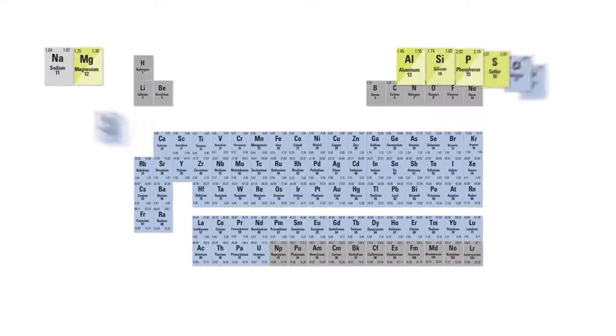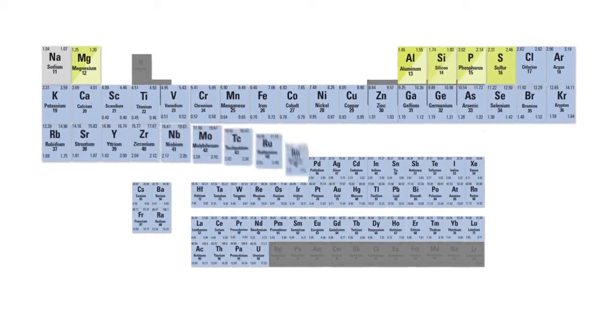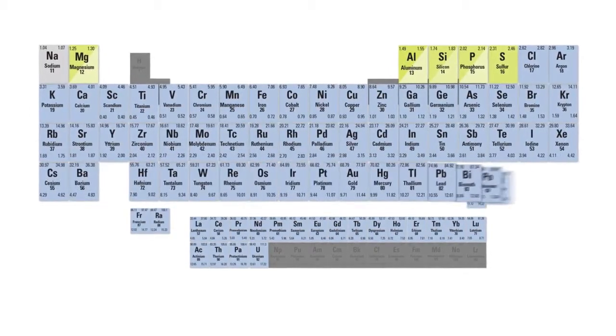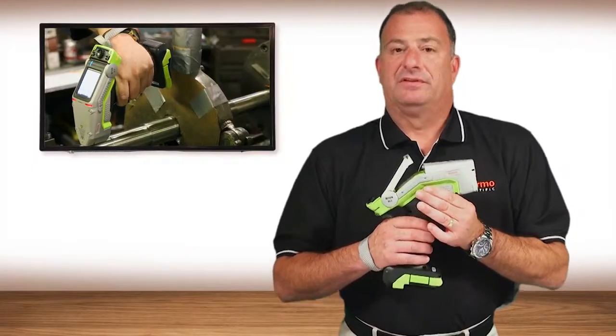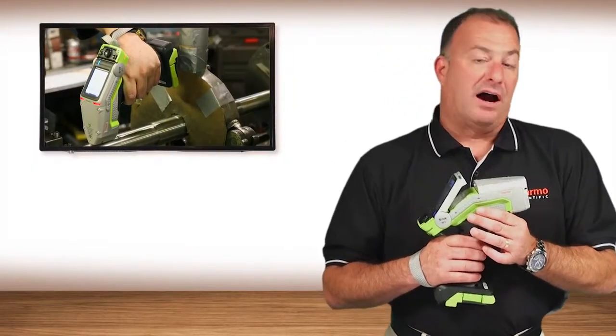This analyzer is capable of quantifying 30 elements simultaneously. Most analysis is performed within two seconds. You have the performance of a laboratory-grade large EDXRF spectrometer in the palm of your hand.